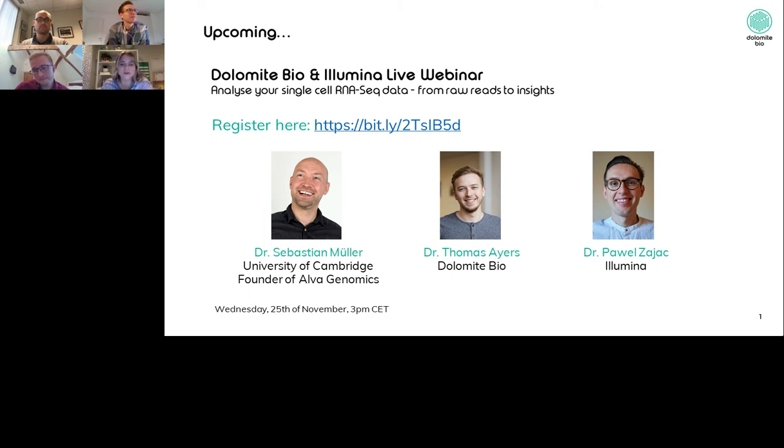Thank you so much. We've got another question. One of the crucial steps in my experience is having high quality cells. How do you make sure the cells you get from clients are of high quality? Do you provide a kit for isolation to ensure quality standards?